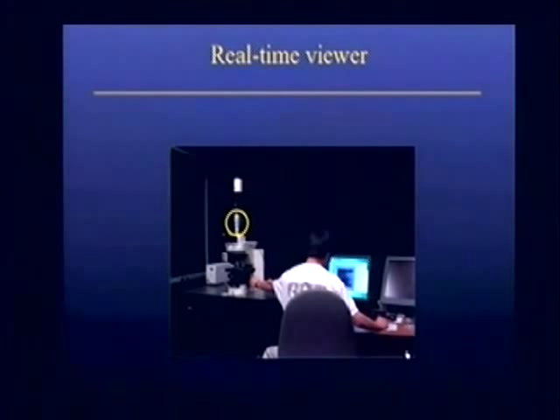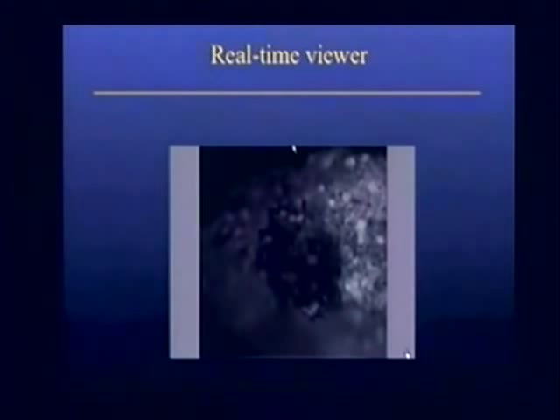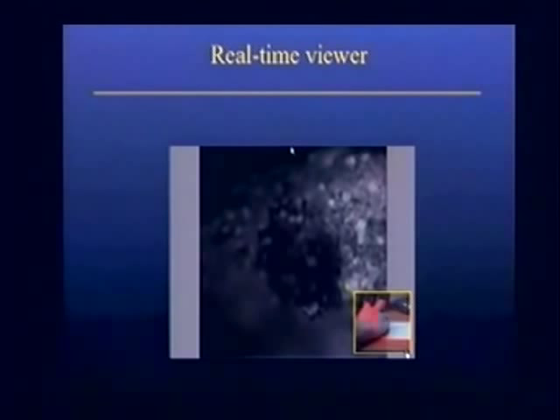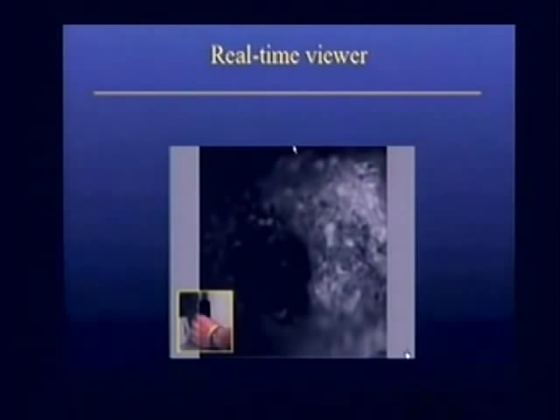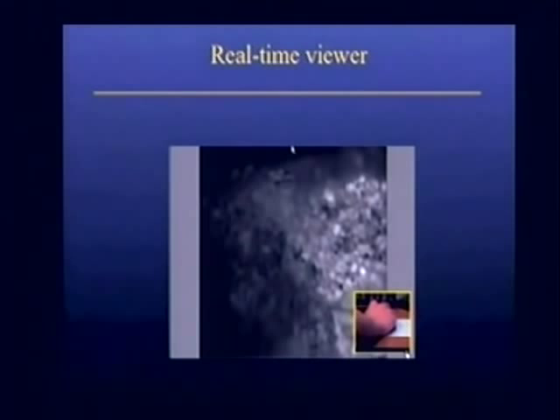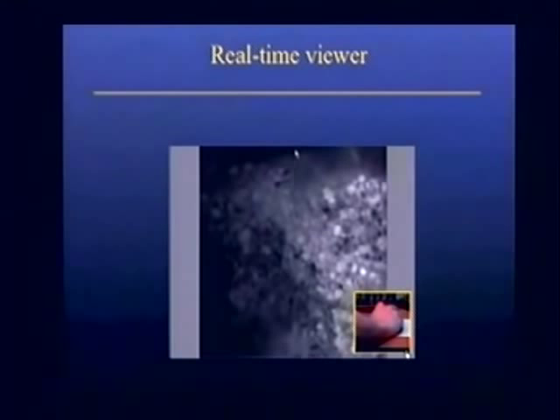In this video, you see my grad student Zhengyan Zhang with his left hand on the microscope and his right hand on the mouse. Using his right hand, he will rotate the specimen digitally. Everything that I've shown you can be implemented in real time on a GPU. It's just sampling pixels or samples from the light field. Then he'll reach over with his left hand and move the stage of the microscope to a different part of the specimen, and it's all being fed into the video camera in real time. Then he'll go back with his right hand again and rotate the specimen, or he could digitally focus up and down if he wanted to. So it becomes this two-handed experience to explore a specimen, whereas usually a microscope only requires one hand.